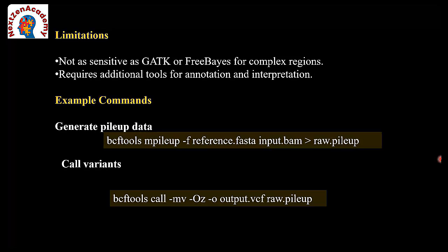But when we run it, it will take a long time. We cannot run it on a laptop or any kind of small machine. We need to have proper HPC platforms, like SLURM, or if you have a proper Linux machine with high storage, you can work with a small set of samples. You can't work with human samples on Linux systems and the like.